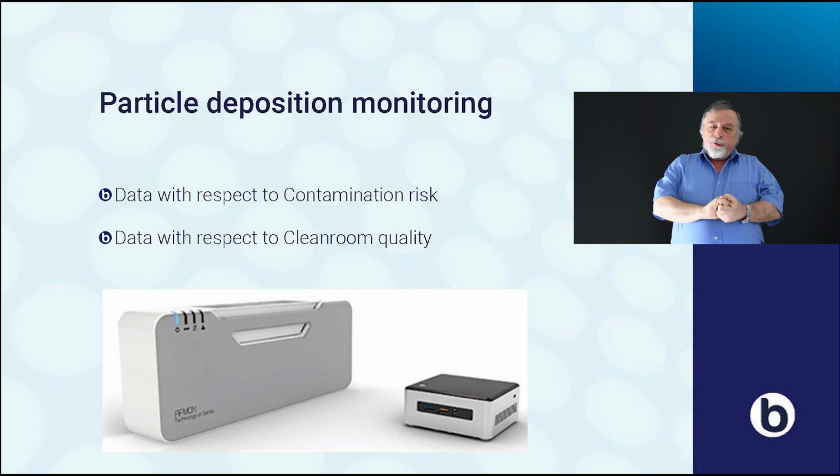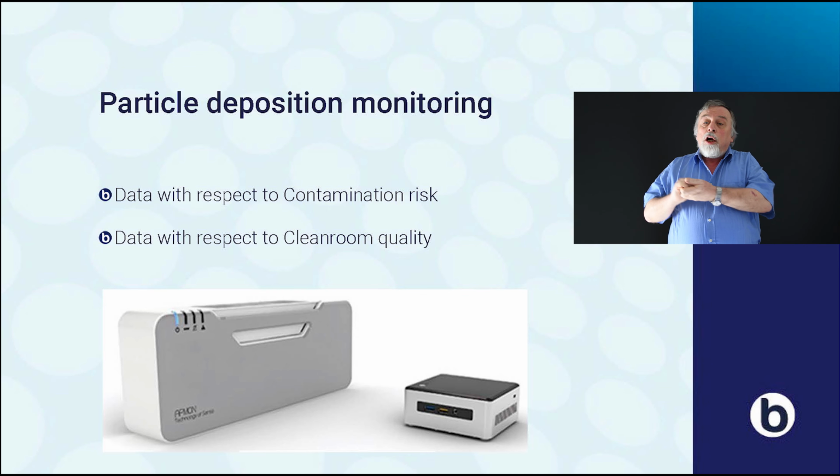Particle deposition monitoring. Now we're talking about acquiring particle deposition data. This data gives you information with respect to your contamination risk, how much is my product at risk, but also with respect to my cleanroom quality: how good is my ventilation, how good is the discipline of people working in the cleanroom, how good is the cleaning program.